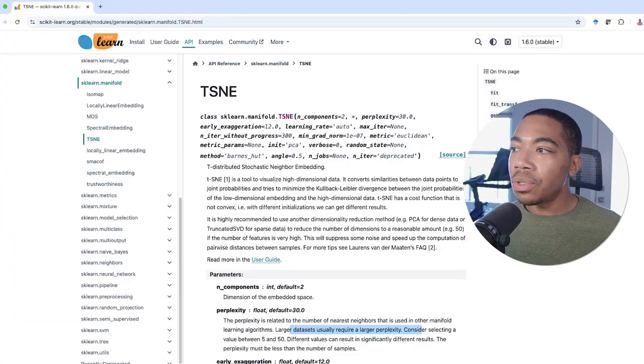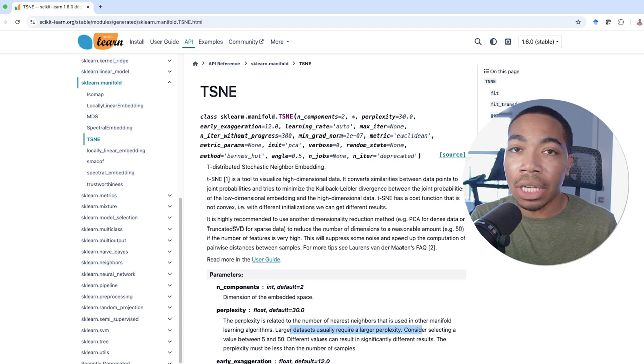So I just wanted to understand, can we see chemical changes? What those exact processes are, this may not be the best device for that, but it can help us to understand what's happening chemically through the lens of a near IR and what we're seeing visually with our eyes in the visible spectrum. So to do that, I want to now process that data. We're going to use t-SNE, which is a manifold technique for visualizing that change.